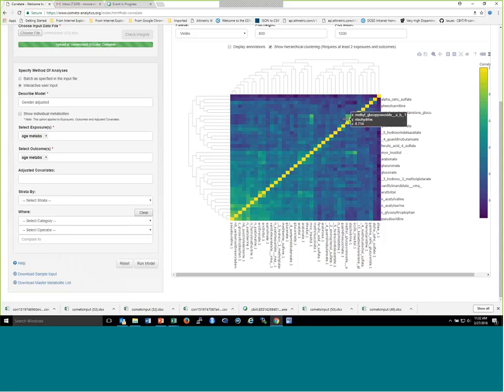So a few things kind of immediately strike the eye. First, there's a little cluster right here. So we have this methylglucopyranoside, scyllo-inositol, stachydrine, these are all citrus metabolites. So it turns out in this particular population, older people consume more citrus for whatever reason, and you can easily see that just in this cluster of metabolites that pops up.